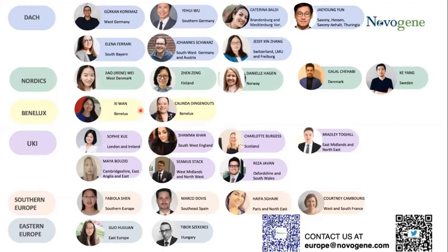Okay, and then for the last question, do you perform variant calling from RNA-seq data, or do you suggest exome sequencing? Talking about coding region variants. So for the exome sequencing and the mRNA sequencing, we do map to the reference genome. For the WES studies, the benefit is its high depth. So we will sequence the exome region at high depth, so the SNP calls from the exome will be more accurate. And for the RNA-seq, of course, we can also do the SNP calling. But if the main research purpose is just to detect the variants, we do recommend using the WES.